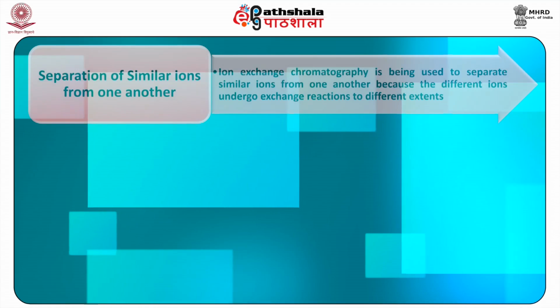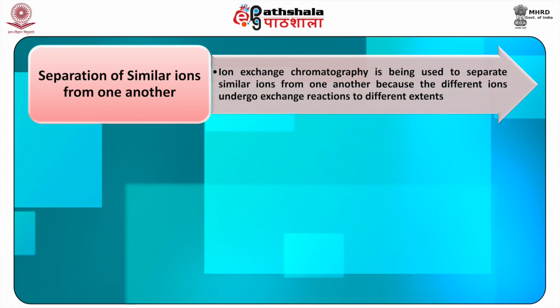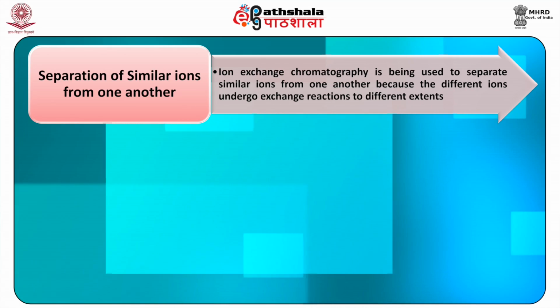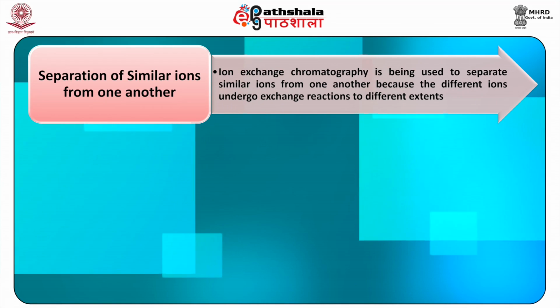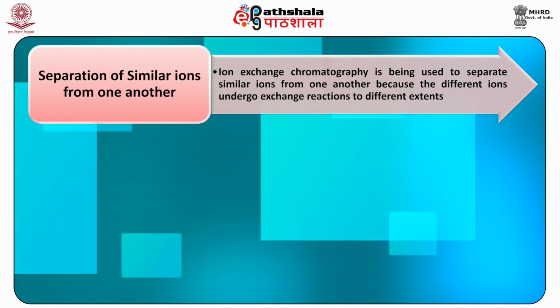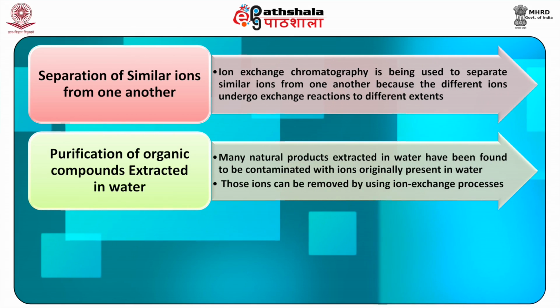Some applications of the ion exchangers are as follows. Firstly, separation of similar ions from one another. Ion exchange chromatography is used to separate similar ions from one another because different ions undergo exchange reactions to different extents.